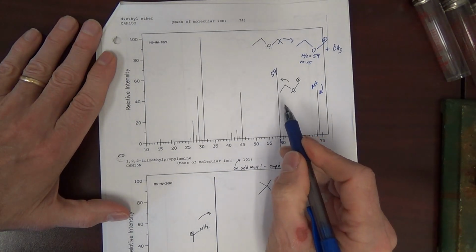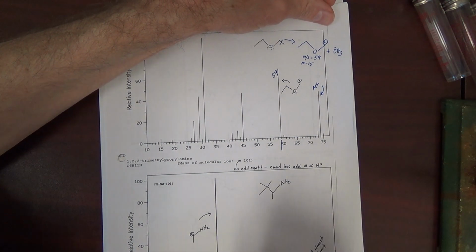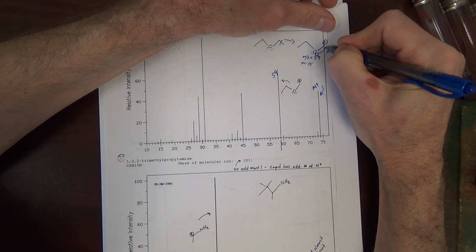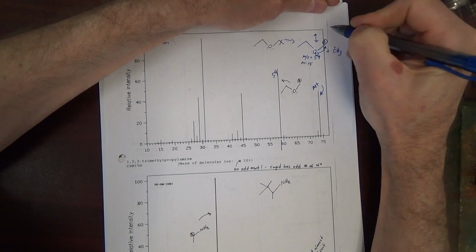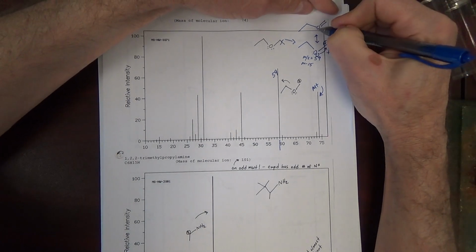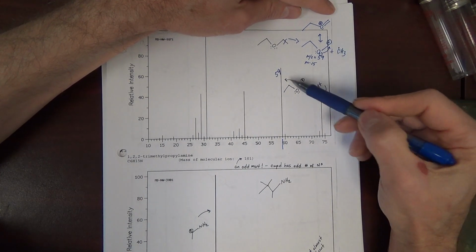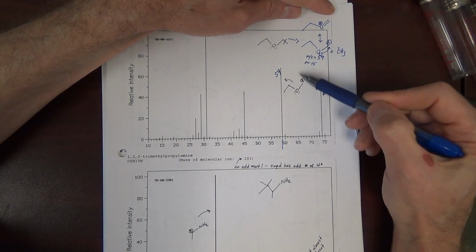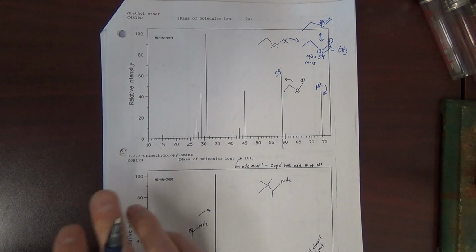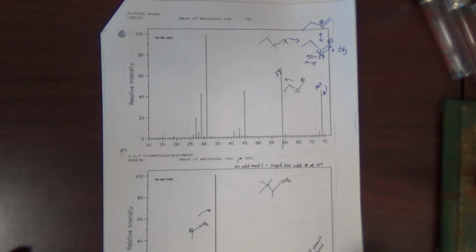It's a very predictable peak, because this is resonance stabilized, and this is just like the one we saw at the bottom of the page that had the instrument description on it. We can do resonance structure here, resonance arrow, and boom, boom. It looks nearly exact same as we saw before. So resonance stabilized cation, and that's why it's a good place to cleave there. And going forward, we will be looking to form resonance stabilized cations. In the previous examples, we didn't have any resonance. All we had was looking at possibly primary, secondary, tertiary nature of the cation.